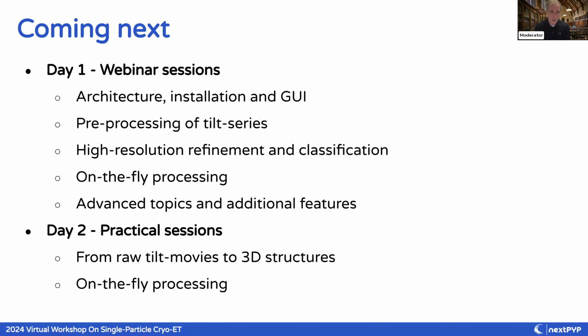Okay, so that's pretty much everything I wanted to say for the intro, and I do want to leave some time for questions. But before we do that, I just wanted to reiterate what Abby went over for the plan for today and tomorrow. You're going to hear in quite a bit more detail about the architecture of the software, how to go about installing it, what kind of resources you need to run it, and what the components of the graphical user interface are. Then we're going to focus on the different steps of the data analysis, starting with the pre-processing.